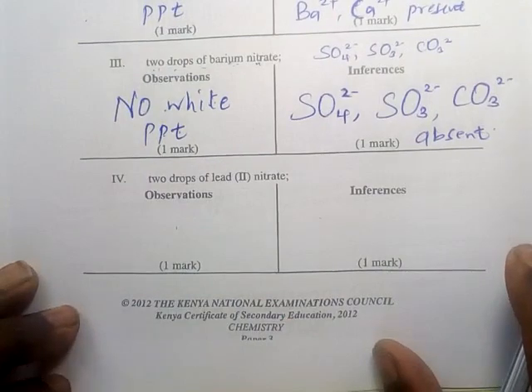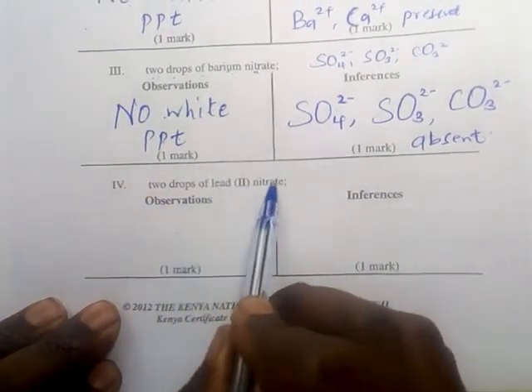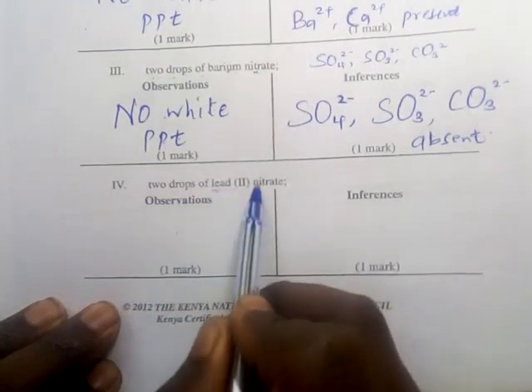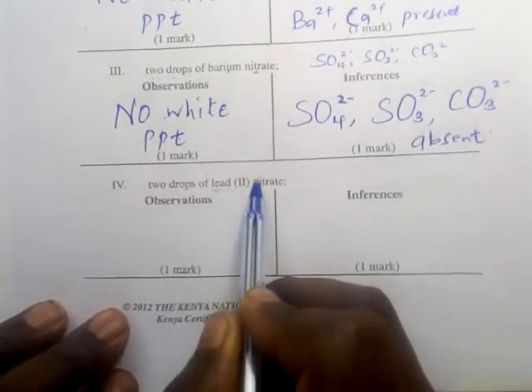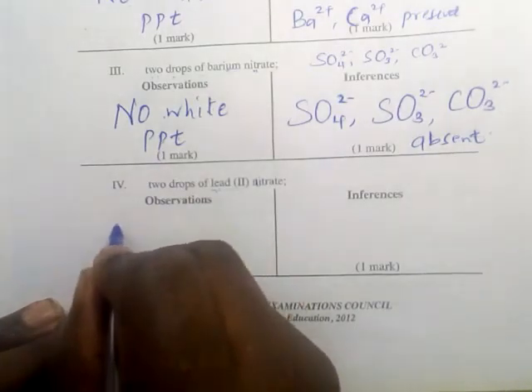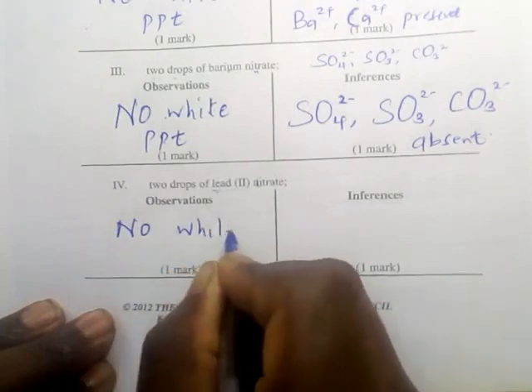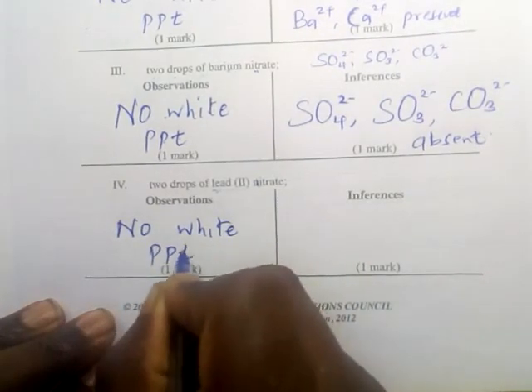To 2 centimeters cube of solution E, add 2 drops of lead 2 nitrate. Now we are adding lead, right? What is observed? No white PPT.